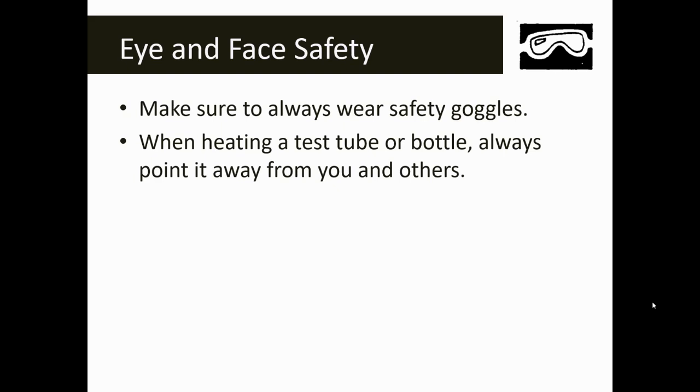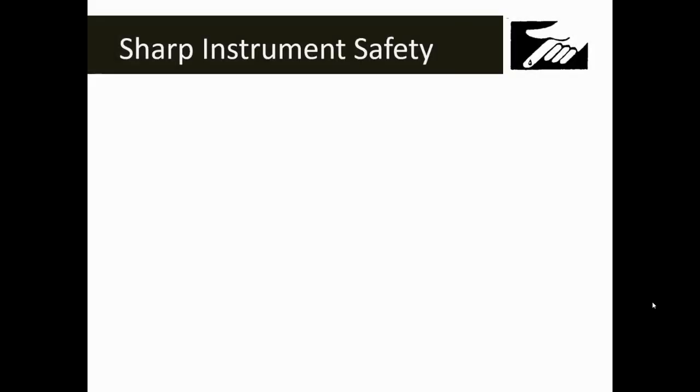When heating a test tube or bottle, always point it away from you and away from your classmates. Never heat anything where it could spurt into your eye or in a closed container — you don't want pressure to pop off into your eye, as that could be very dangerous. If you're heating a test tube or bottle, make sure that you're not standing over it. We don't want anything to happen to your eyes.